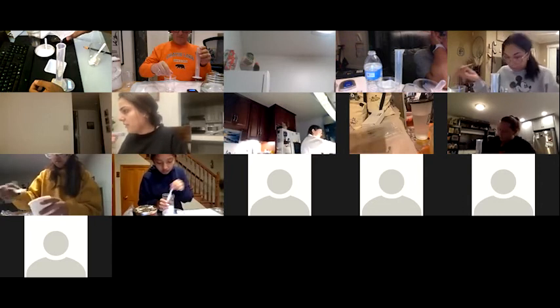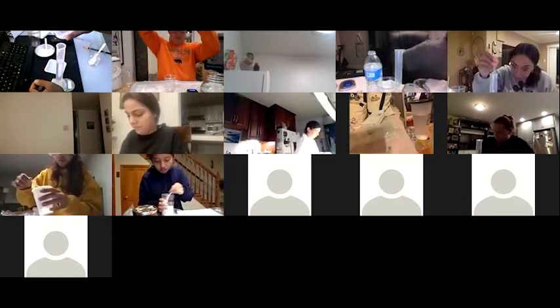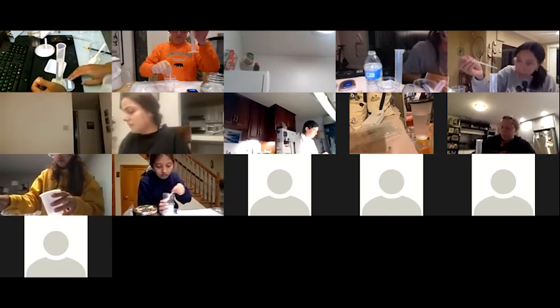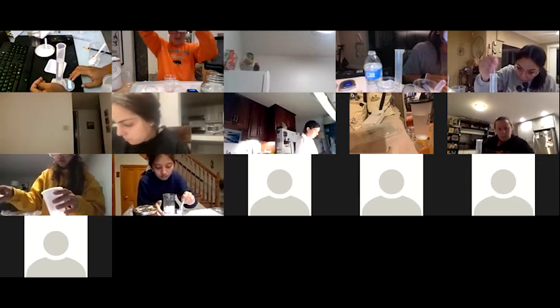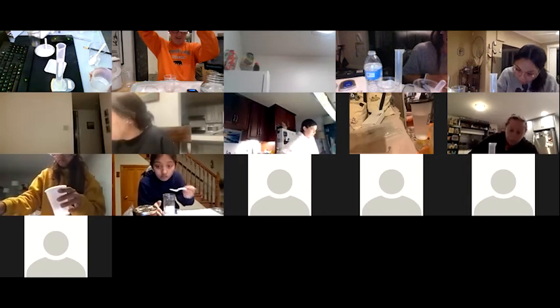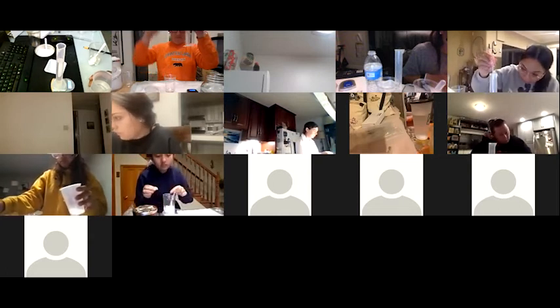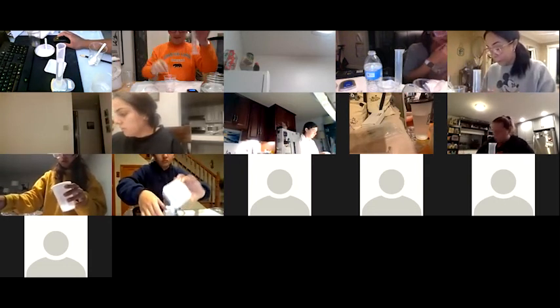Okay, thank you. Got it? Were you holding it down? Was that the issue? Yeah, that might have been it. Maybe I was pressing it too hard by accident. Yeah, these things are fairly delicate. I mean, they're not like the home scales, which could take a bit of a beating.